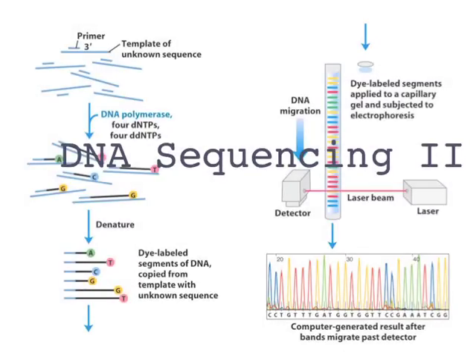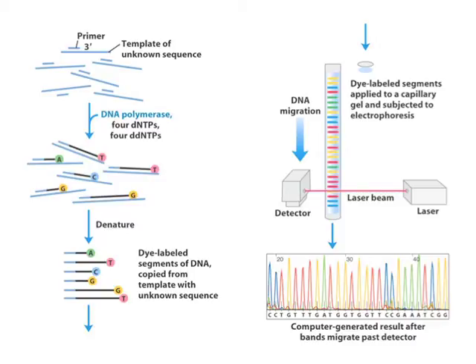I'd now like to go over the more modern technique of DNA sequencing where you're able to use just a single reaction and you are not required to use radioactive labeling for this. And so this makes it a much more attractive, streamlined method of DNA sequencing.